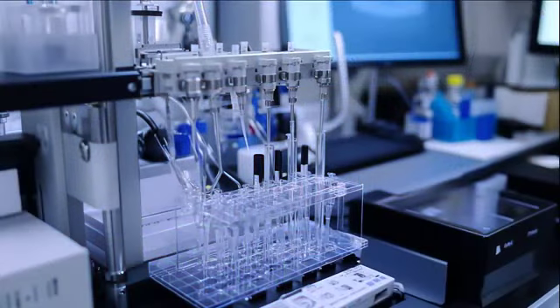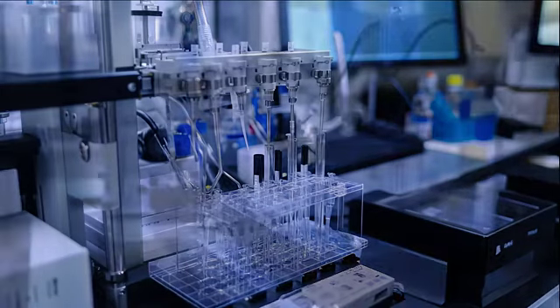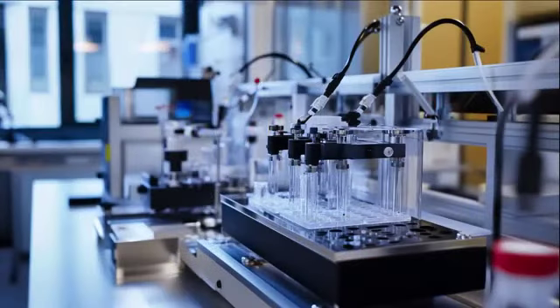for reliable operation. Integrating Lab-on-a-Chip devices with mass spectrometry enables direct high-sensitivity chemical identification by coupling on-chip sample preparation with mass analysis. For example, a chip can pre-concentrate and ionize analytes before transferring them to a mass spectrometer, much like an assembly line immediately inspects products for quality assurance.